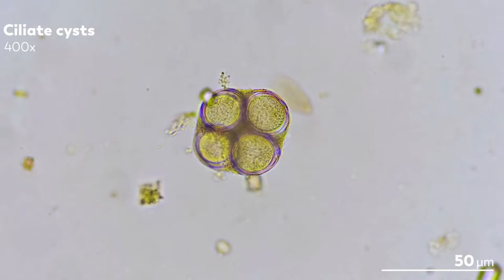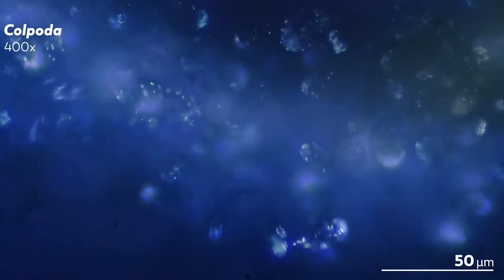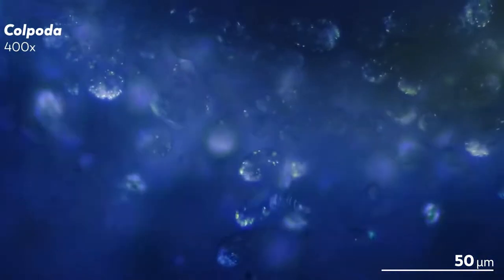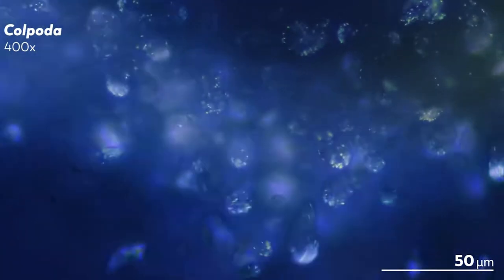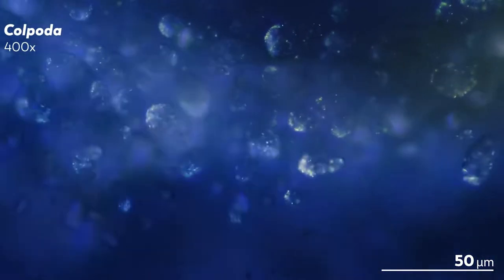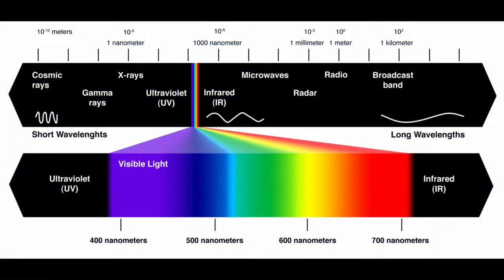There is, however, a limitation to optical microscopes: the size of the object. There is a limit to the size of objects seen under the microscope, which is the visible light wavelength. This length scale, which is of the order of a few hundred nanometers, characterizes how sharp a light beam can be tuned.